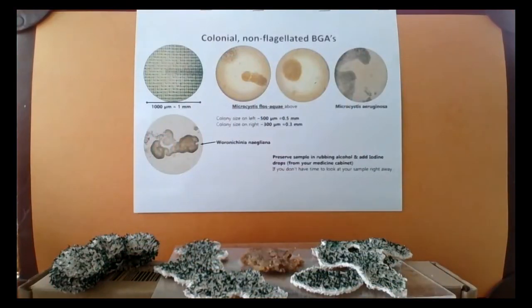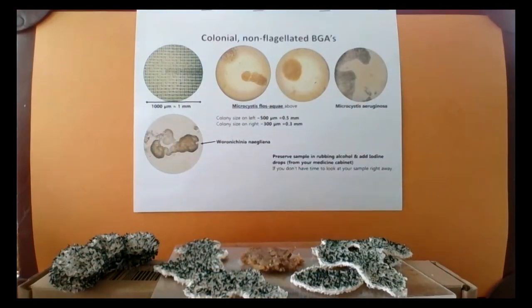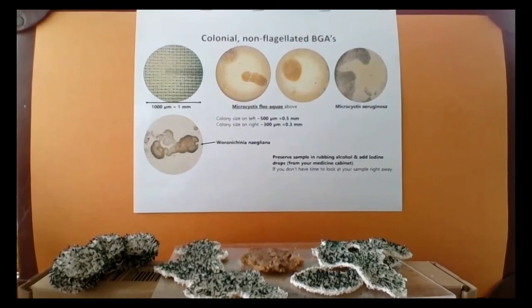Also, when I take a picture of my sample, if I zoom in, and if I come back to my photo later and want to know how big a colony it was, it will be difficult to determine. If the size may be of importance, make a note on your phone picture that you zoomed in on. Take a mesh micrometer photo with the same amount of zoom. That will make it easier to determine size.